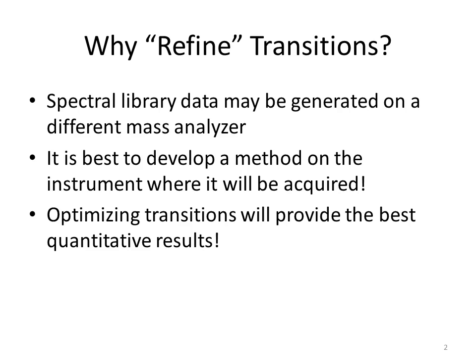So why refine? I think Brendan had this in his workflow too. The idea here is you don't generate any good quality data-dependent data from a triple quadrupole mass spectrometer. You do generate reasonably good quality data from an HRAM platform, but you still start off with data that was generated from a method that wasn't specifically targeting something. So you won't have lots of points across a chromatographic peak unless you're looking at the MS1 in HRAM, because the product ions you generate in data-dependent runs usually get 1 or 2 spectra. So you can't quantify off of that.